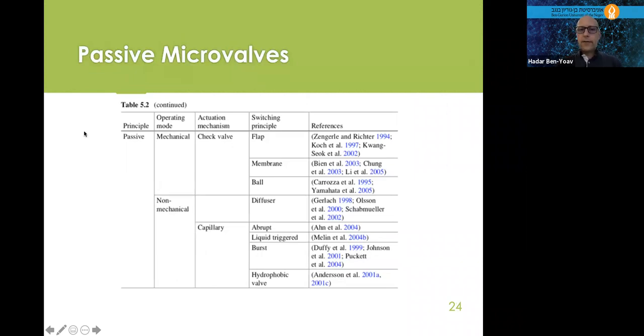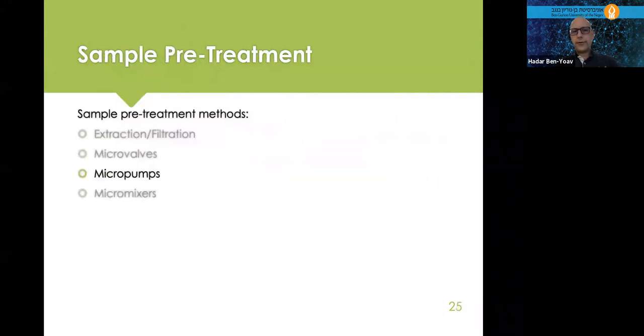Passive microvalves, we don't want to apply any energy. We have mechanical and non-mechanical. We have capillary microvalves, which work by the capillary forces of the solution, and a lot of different other examples that I won't go into.